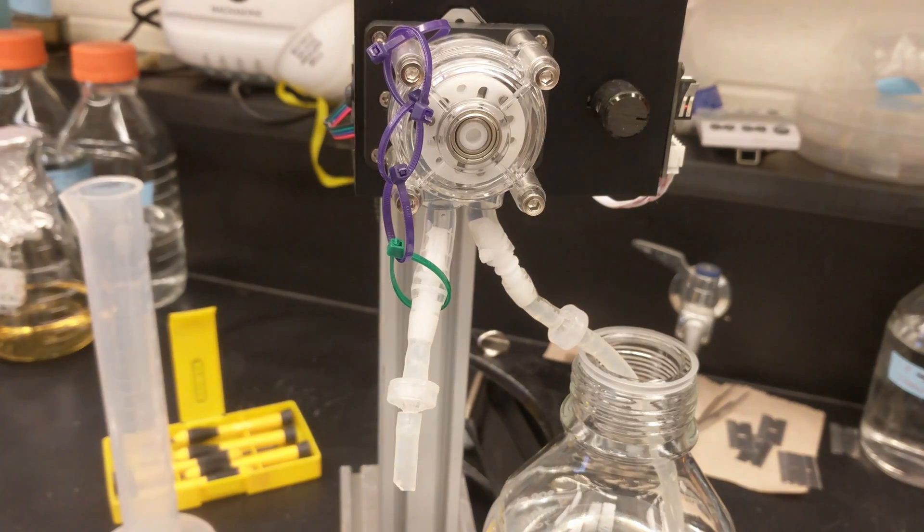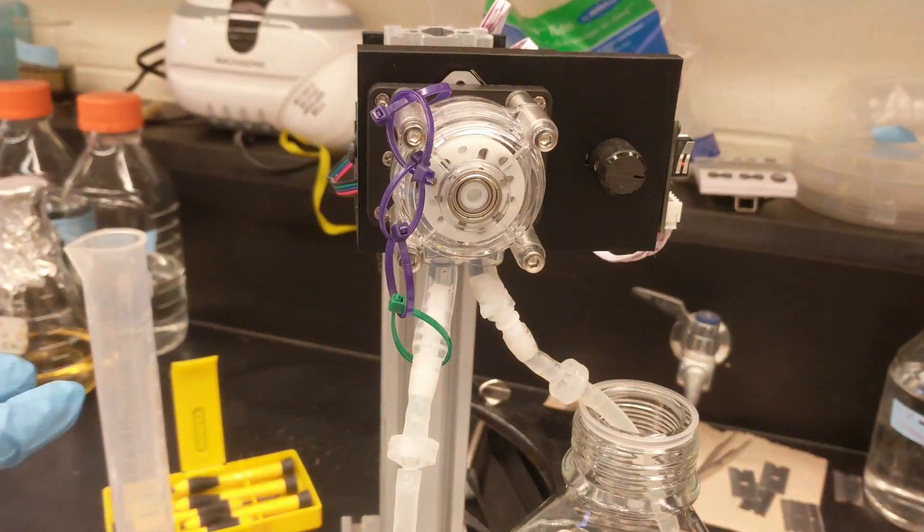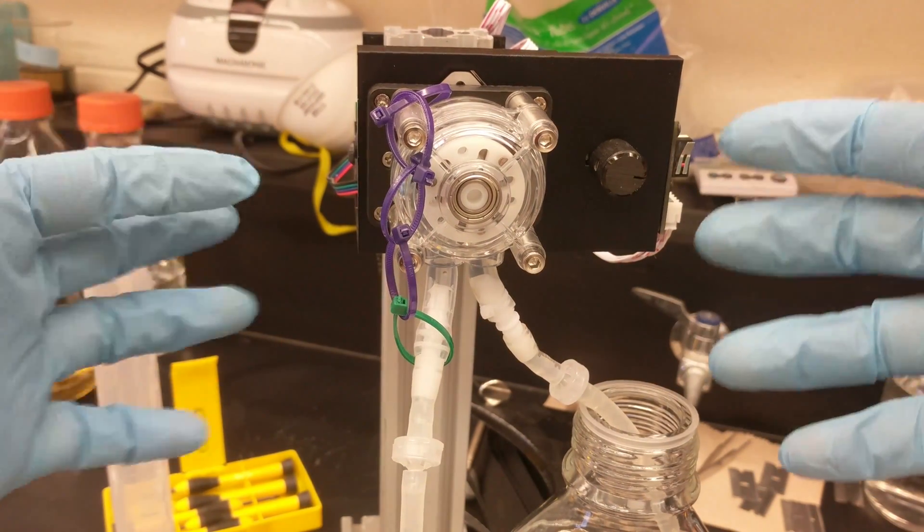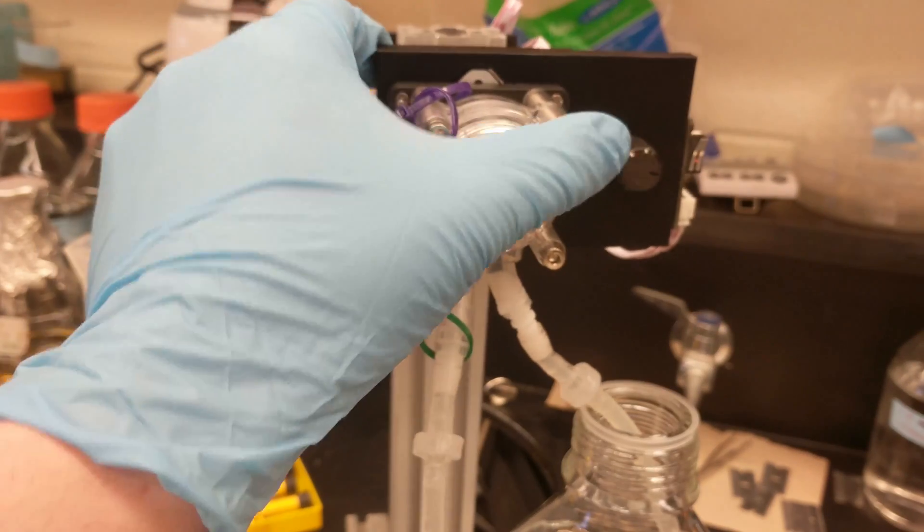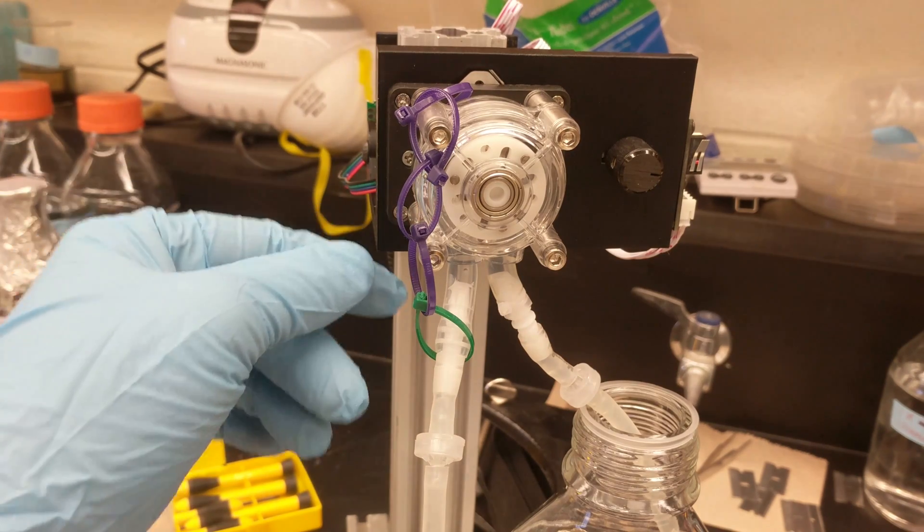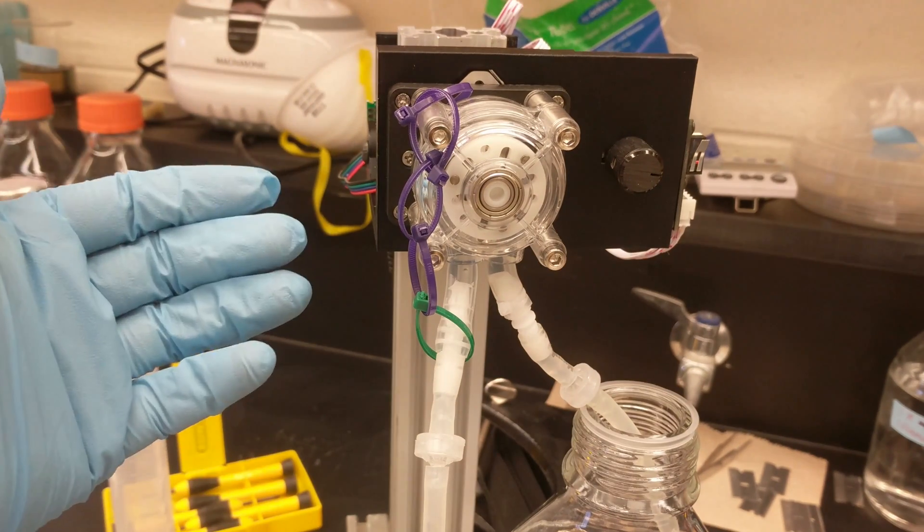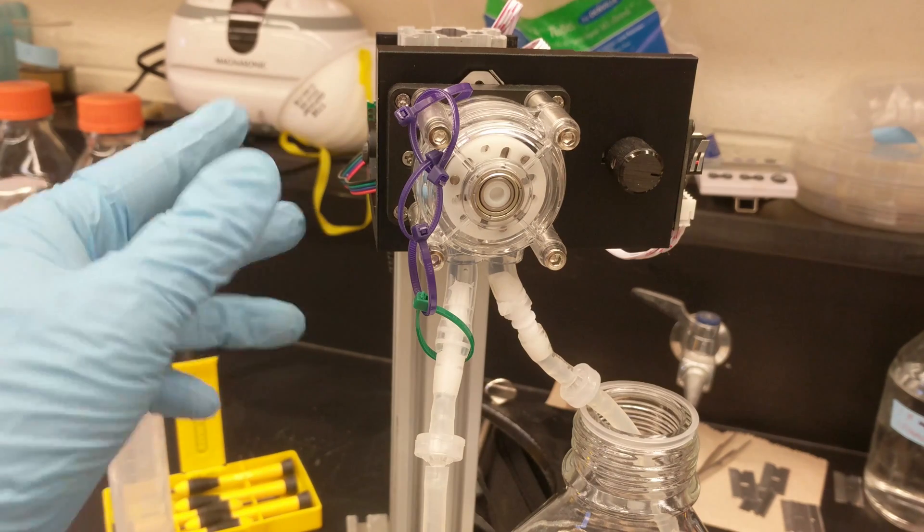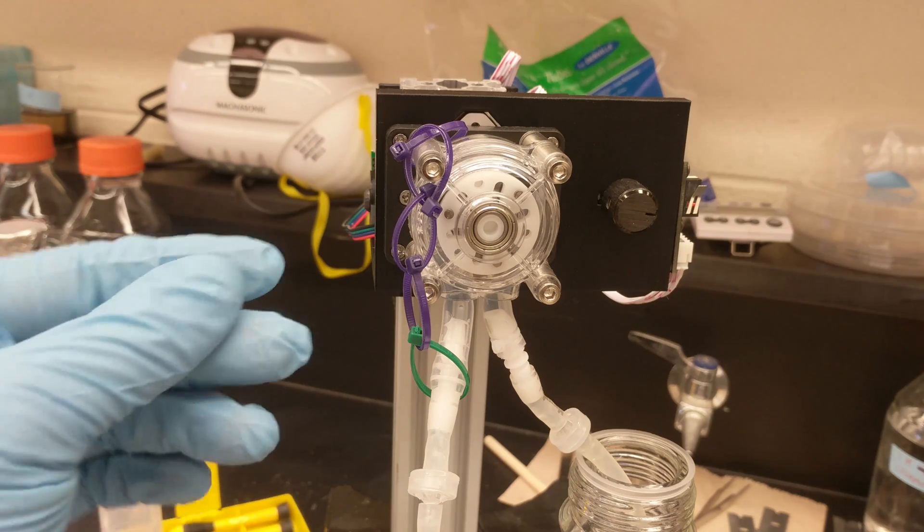You could even have a row of these and a row of bottles beneath it for sort of a full dispensation station. And this design, it's pretty reminiscent of bartending robots, so as long as nothing in here touched stuff in a lab you could use it to dispense alcohol or food or whatever.